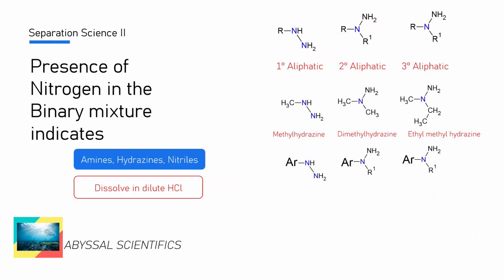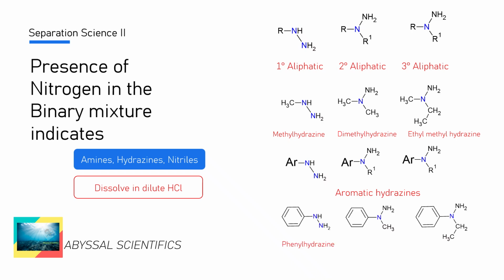or aromatic hydrazines: phenylhydrazine, methylphenylhydrazine, ethylphenylhydrazine. Like amines, these hydrazines are also basic and they also dissolve in aqueous dilute acids. Example, aqueous 5% HCl.